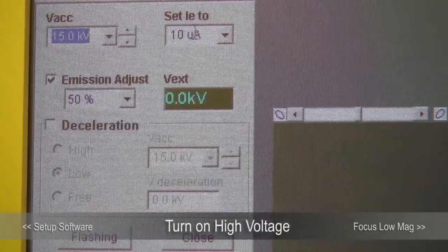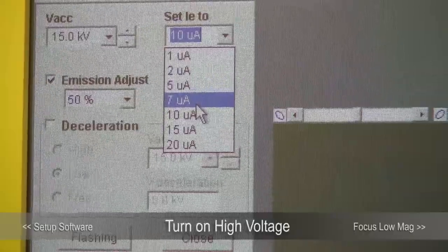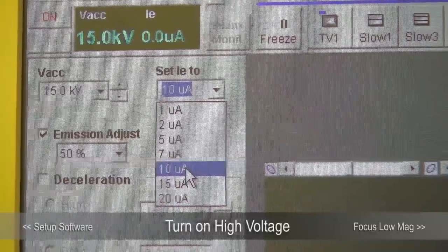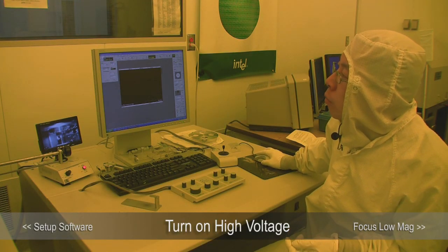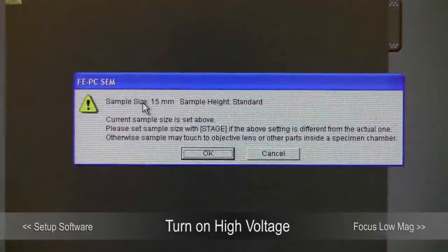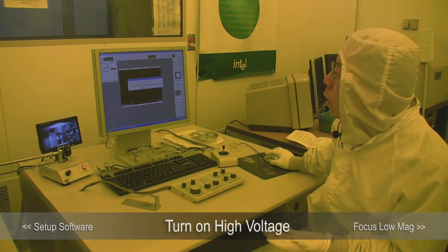The emission current is similar. Higher emission current gives you better signal-to-noise ratio. Lower emission current gives you better resolution, but then you might need a longer integration time to get the same signal-to-noise ratio. Most people will use 10 µA or 7 µA. After choosing the accelerating voltage and emission current, click On to turn on the high voltage. The software will remind you one more time — you have chosen sample size and standard height. If this is correct, click OK and the high voltage will come on.